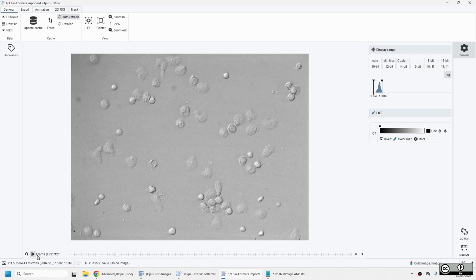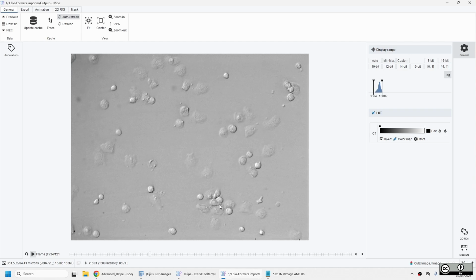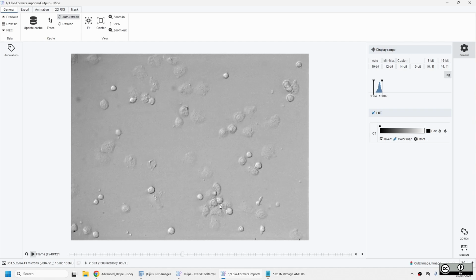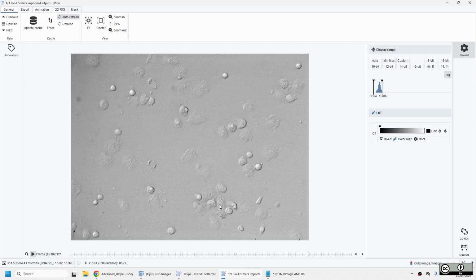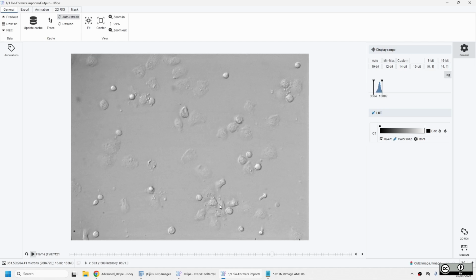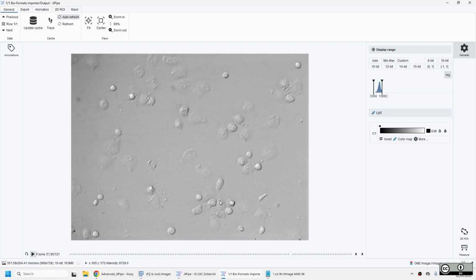This is, I think, one of the control examples where they were not limited in their mobility. But then you will see them moving, and the idea would be we want to find them, and we want to track them in time. And from the tracking, I want to know the speed at which they move, how far they are from each other, how zigzaggy their paths are. Do they move straight? Do they wander about? Do they move randomly around? All kinds of things. And this is the target of this project. And like I said, this is a real project that we published, I think, last year with collaborators.